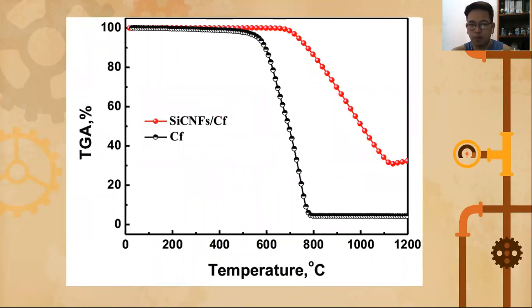while this one shows the TGA curve of pure carbon fibers and silicon carbide nanofibers coated in air.